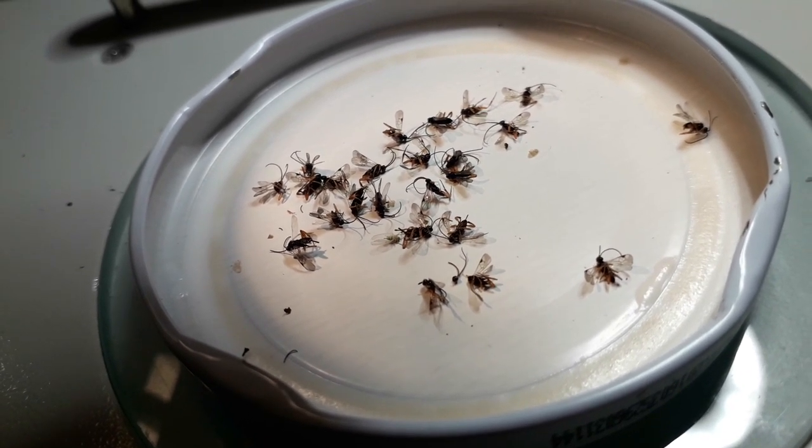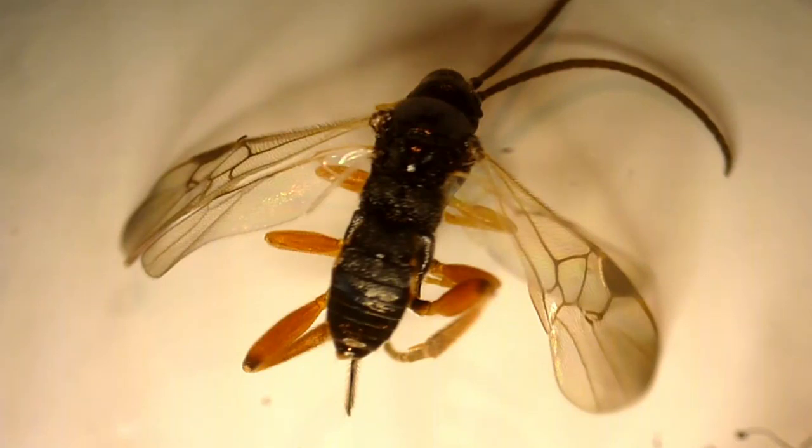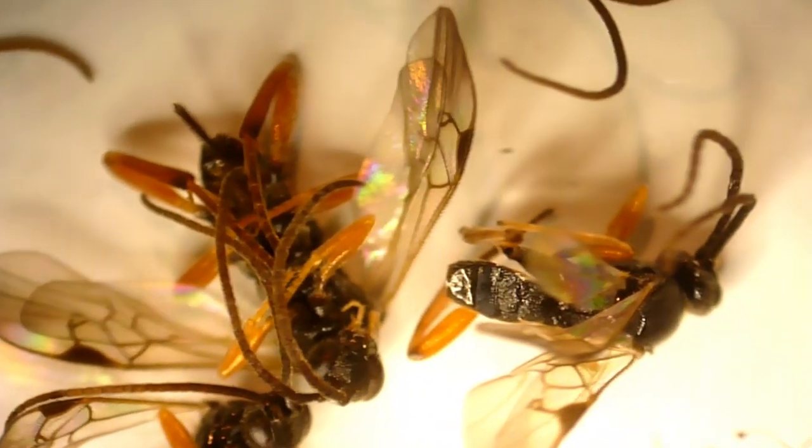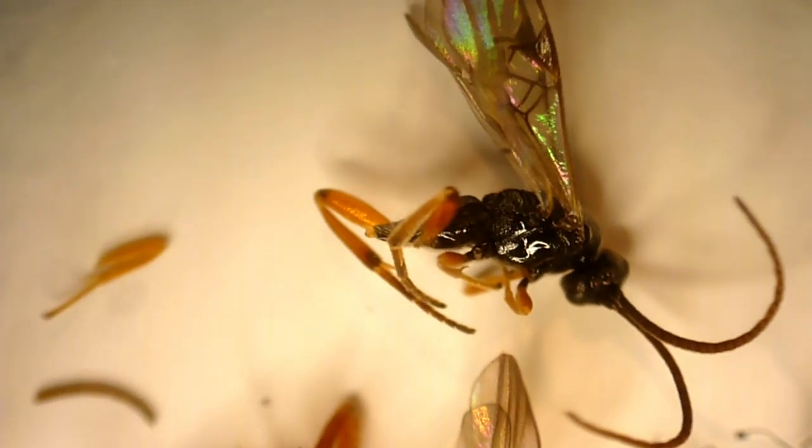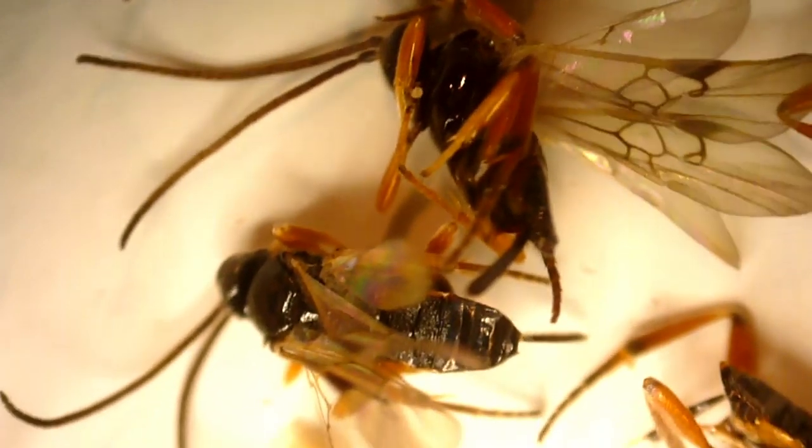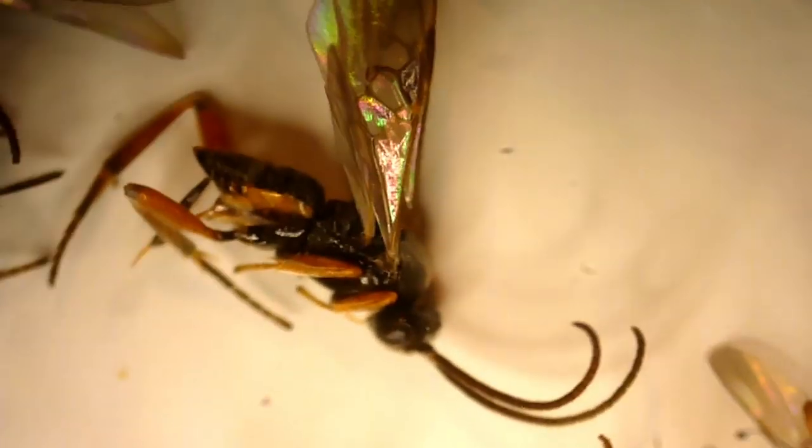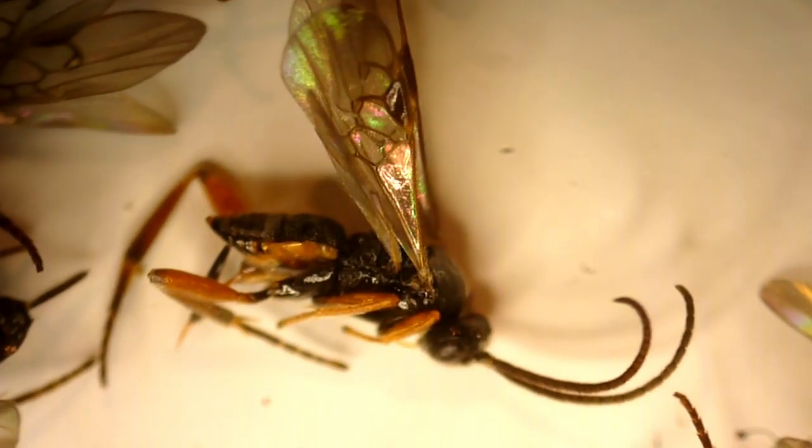I discovered there seem to be two different types of wasps. For example, this one here has a stinger on the bottom - quite a large structure emerging from the abdomen. Other wasps did not, so maybe this is one way of distinguishing males from females. Another thing I noticed is that many body parts and appendages were broken off because the wasps are quite fragile. They are completely dry now after several days, which makes them rather difficult to handle and manipulate. As soon as you touch them, some parts like to break off very easily.